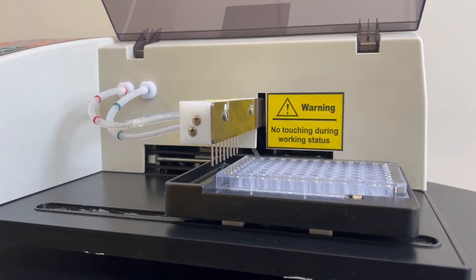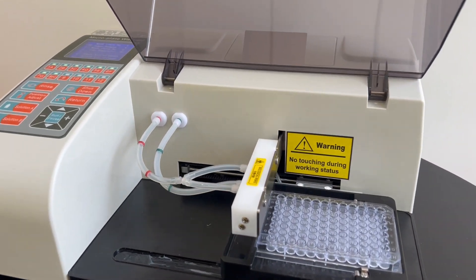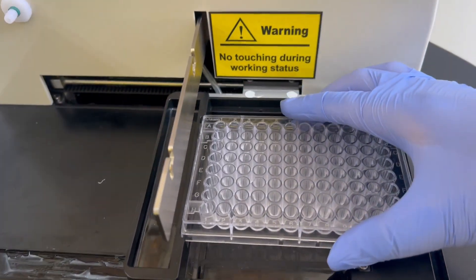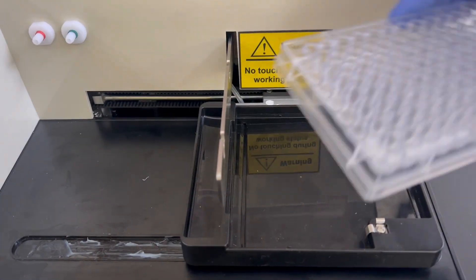Choose between default settings or manual operation to select the desired multi-plate functionality. Our plate washer is compatible with a wide range of microplates, including flat, U, and V-bottom variants, providing versatility for various experimental needs.